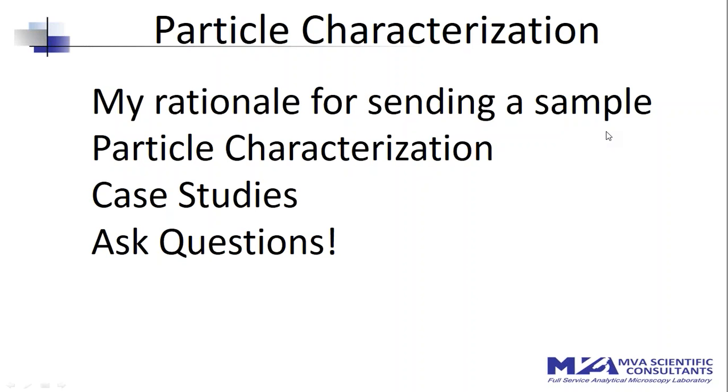The second is I like to be kept apprised of the progress or the lack of progress of their analysis of my sample. There's other things going on constantly, but it's still nice to have an update saying, hey, we just got a chance to look at your sample, or this is what we're finding. This is preliminary data, and with that is a big caution because that data can change as the analysis proceeds, and I certainly expect that.